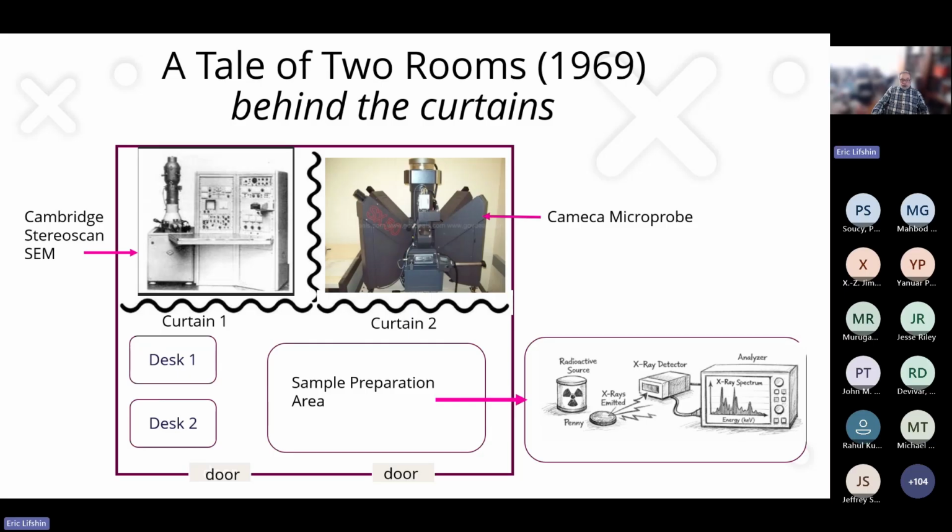And then in 1966, there was a paper in Science by Bowen, which showed that solid-state X-ray detectors could be used for X-ray analysis, that they had some reasonable energy resolution. The 66 paper talked about use with X-ray fluorescence.